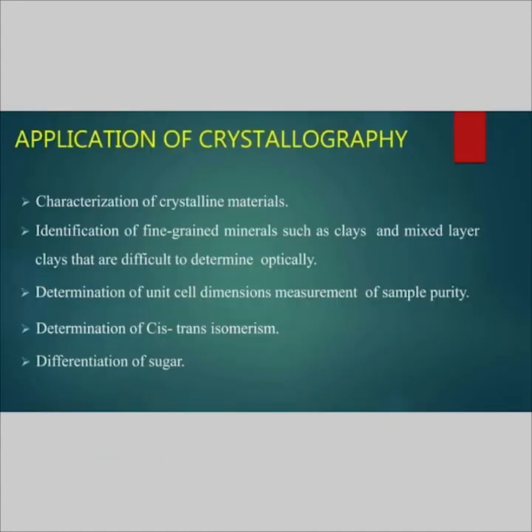Now comes the application of crystallography. This technique has various applications in various industries. The first is that it is very useful for characterization of crystalline materials. It is also used for identification of fine-grained minerals such as clays and mixed-layer clays that are difficult to determine optically.